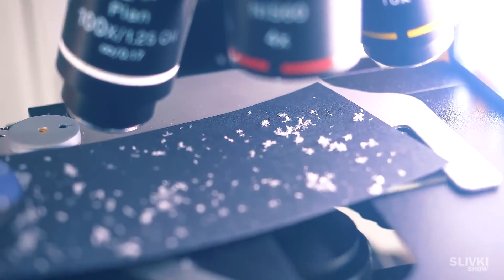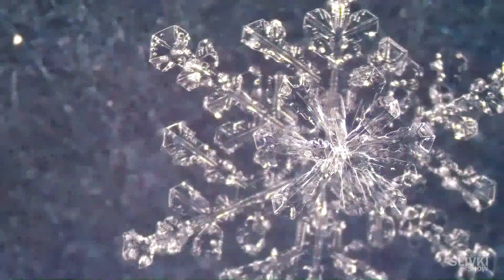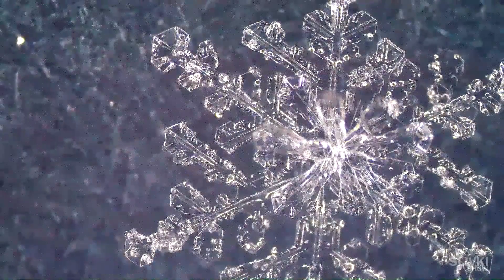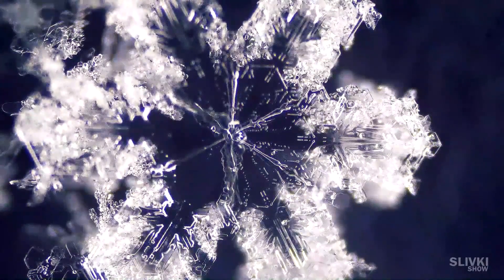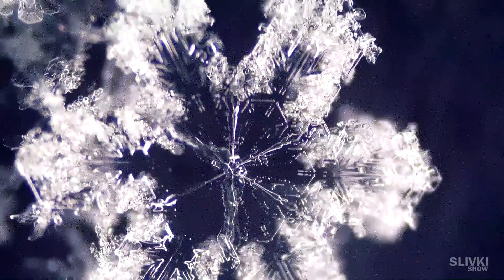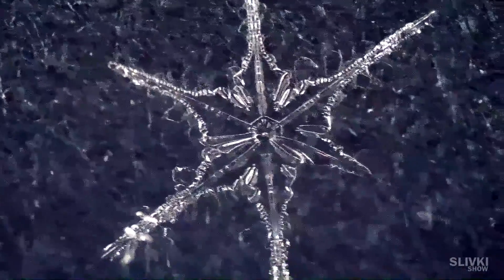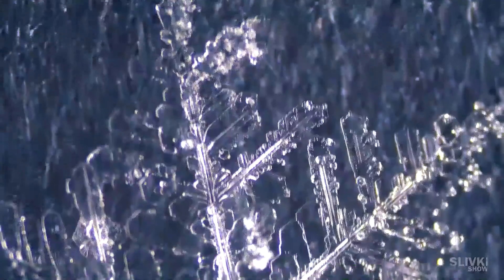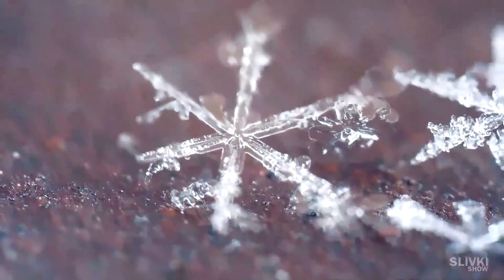It turned out that all snowflakes are different. For example, this one wasn't flat but three-dimensional, with a mini snowflake on top and a bigger one underneath. Sometimes I come across these ugly mutant snowflakes, and next to them were these fluffy beauties. There was also a damaged snowflake — on the way down she lost one limb, probably as a result of a collision with another. They say that no two snowflakes are alike, and it seems that is true.